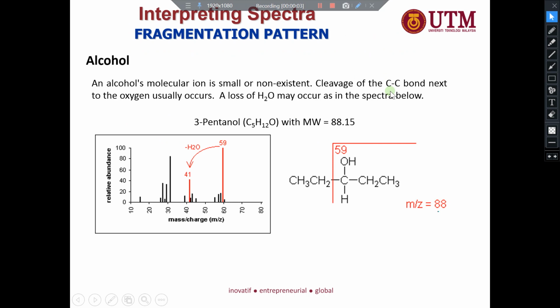In the next slide, we will learn about alcohol. Compared to the previous one, which was a hydrocarbon compound without any functional group, with only branching or no branching, here we learn about alcohol.